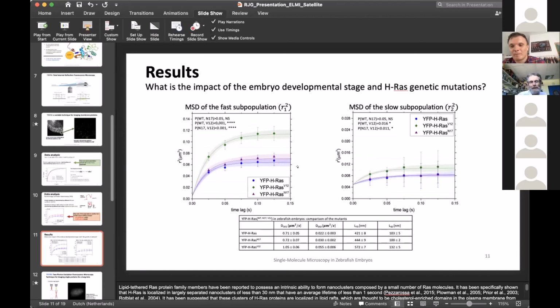Okay, so your hypothesis, in fact, is that the activity of the enzyme would change the physical barriers that border this microdomain. Would it be possible then to have a double system with two different diffusing molecules, for example with two different colors, to see whether this mutation would change the diffusion microdomain of another protein?